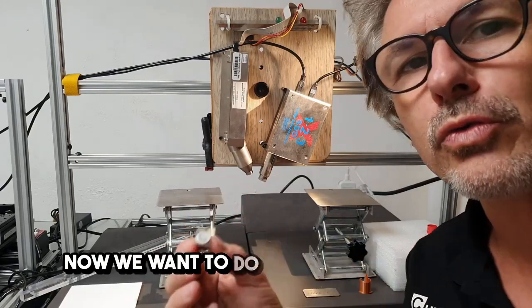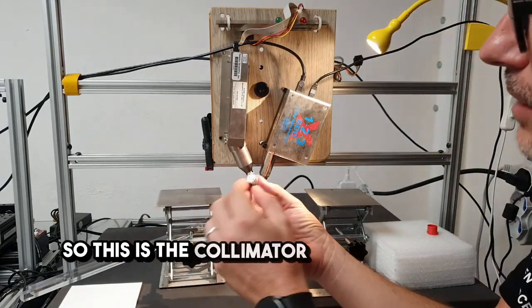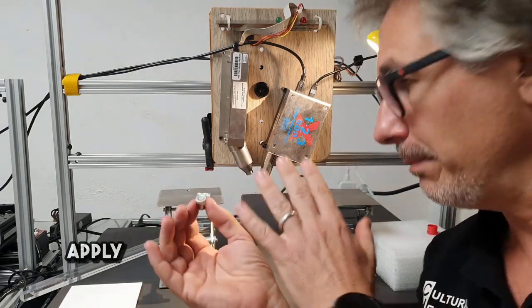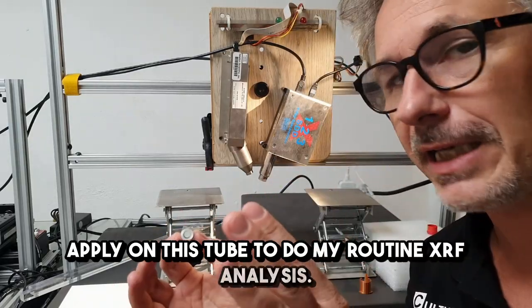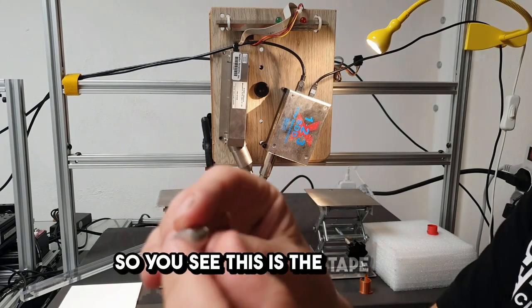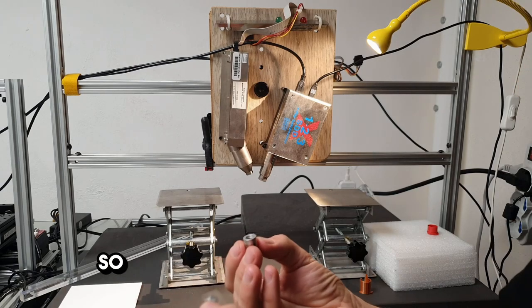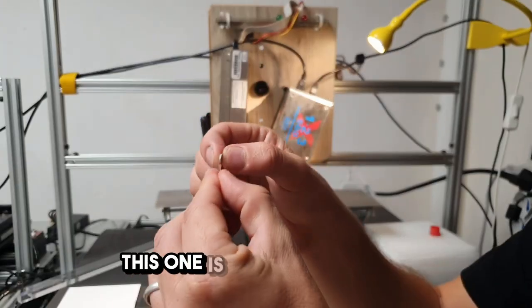Now we want to do another experiment. This is the collimator with the filters that I usually apply on this tube to do my routine XRF analysis. I'm removing the filter. You see this is the tape that is holding them in place. There are two filters.